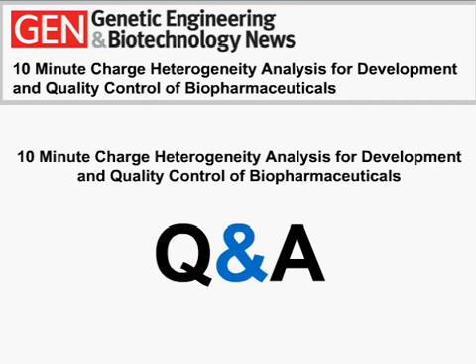Other excipients, obviously things like Triton X-100, things that absorb in the 280 range, are not going to be very beneficial for sensitivity. And looking at concentration, this is the hard thing about isoelectric focusing. Unlike, say, CE-SDS, where you get a single peak, you can get a wide range of charge variants, so that can cause a dilution effect.